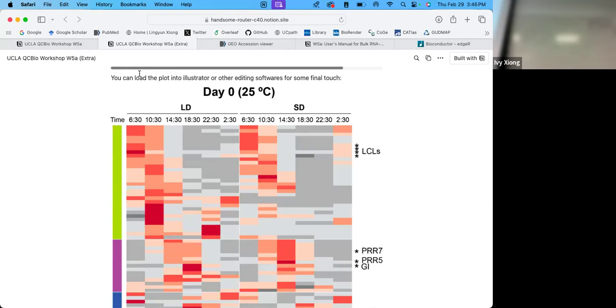Then you copy. Yeah, where is it? It'll be a different folder. It's in your process, yeah. Then which we have the process.